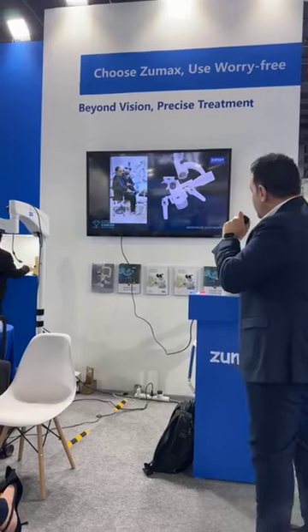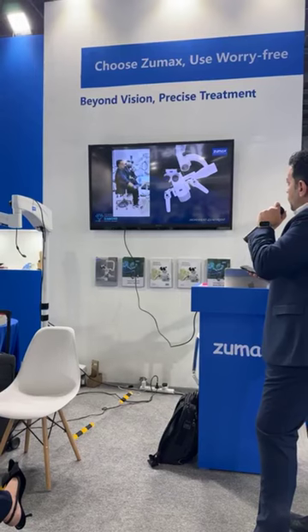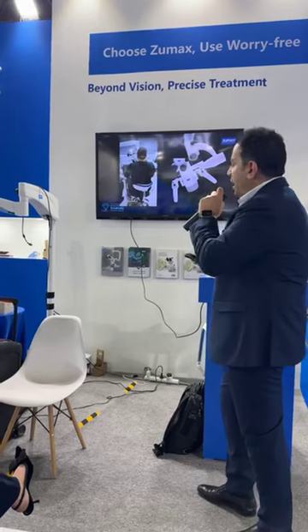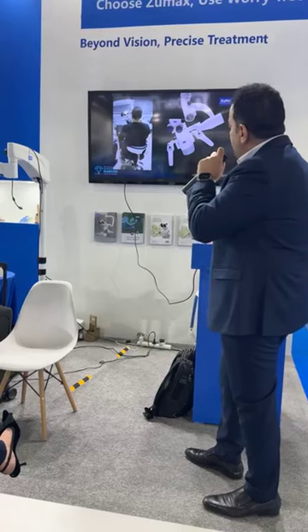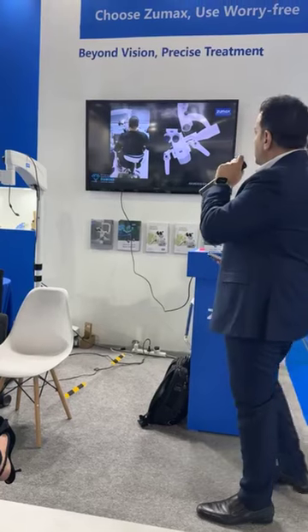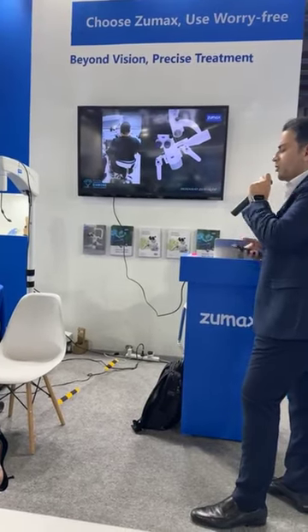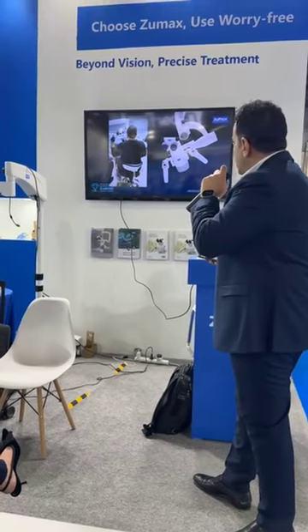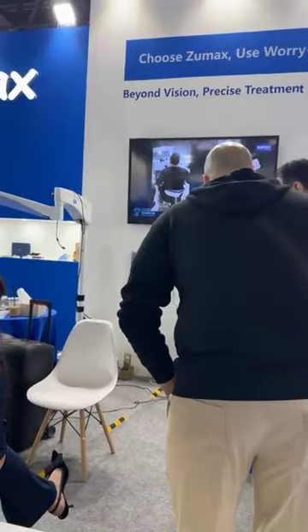This is the way. If you look from the back, you need to have a good shoulder rest. With a rest, you can control the level. This is too deep, it's not okay. It's also too high, it's not okay. You need to adjust it to have a good shoulder rest, which gives you the advantage of ergonomics with a microscope.